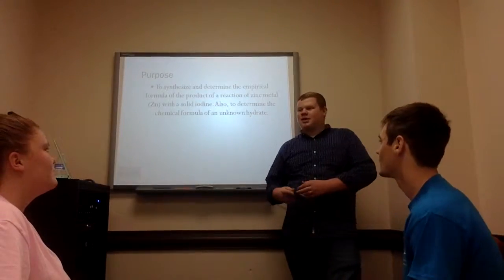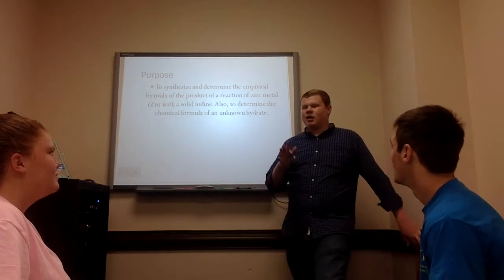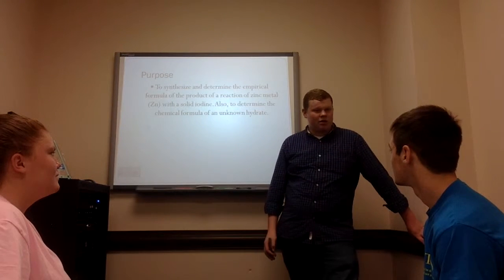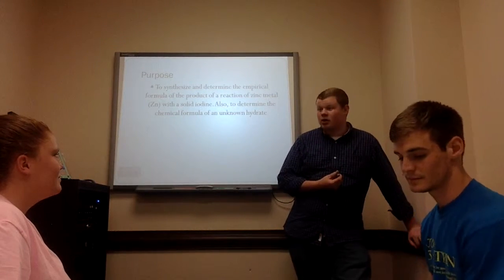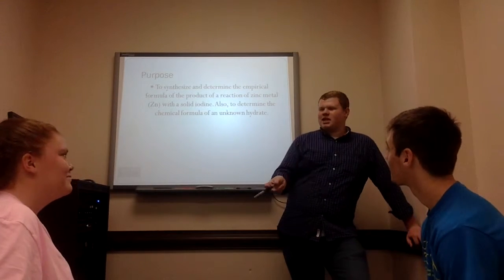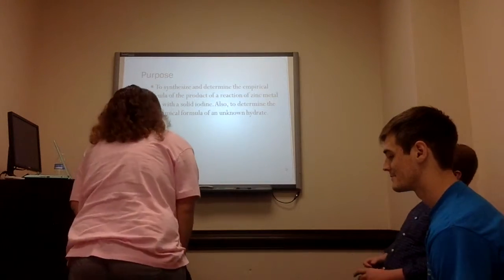And so, as we're about to begin the experiment, I looked through your all's pre-labs today, and as I was typing over here, I used a very excellent example of a pre-lab purpose. Ms. Jackson, I used your purpose statement. Could you come up here and explain to us a little bit about your purpose statement? Read it to us and talk about it.